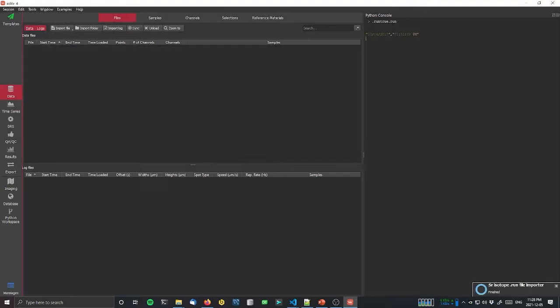Okay, so now we've got a little bit of space from those debug things. So it's printed out the line that it's found. That's great. Now what we want to do is create a datetime object from this string. Because remember, this is just a string. We don't know how many seconds since epoch this is, but we can do that now by converting it.